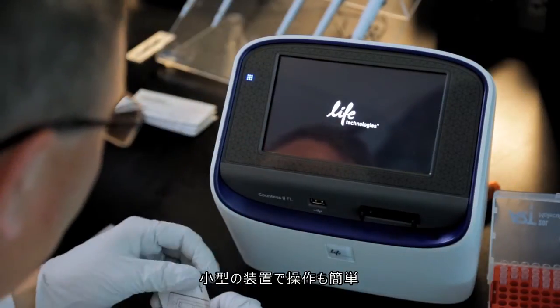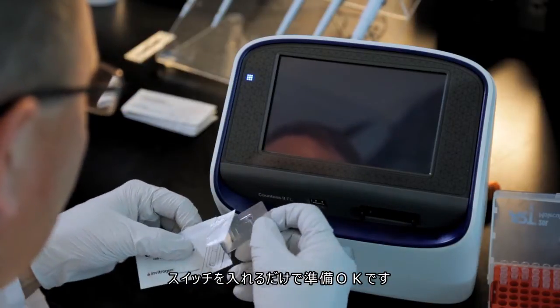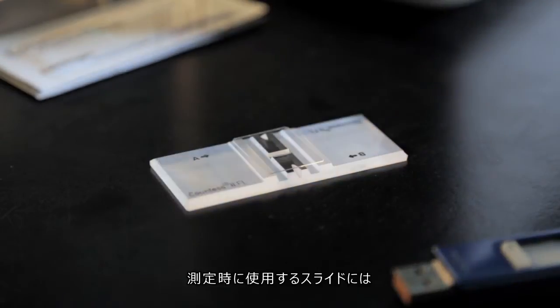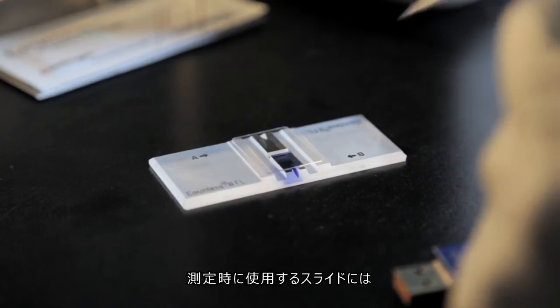The Countess2 FL automated cell counter is small and easy to use. Simply turn on the switch and you are ready to start counting. For traditional bright field cell counting, add TripanBlue stain cells to the counting slide.